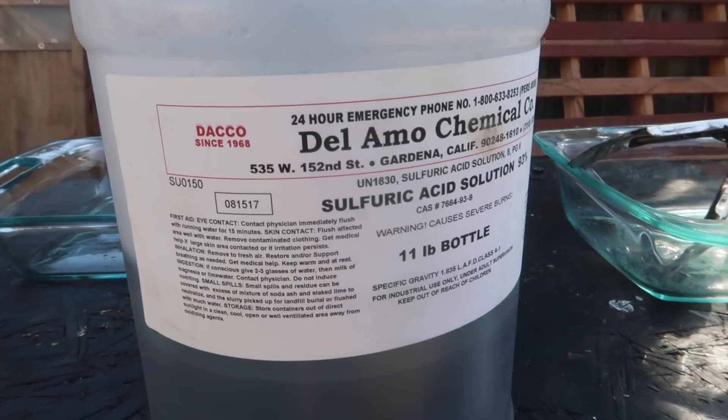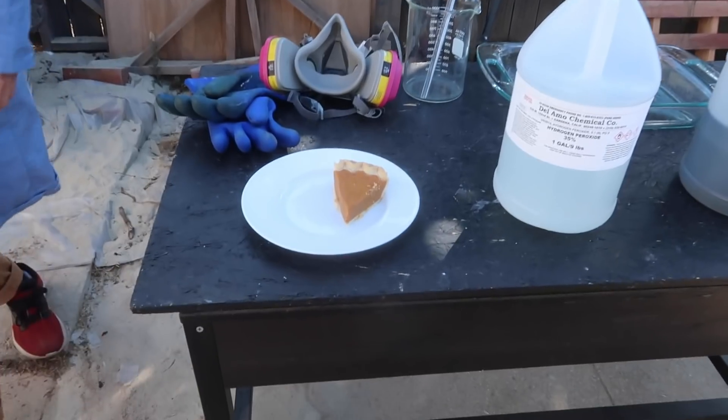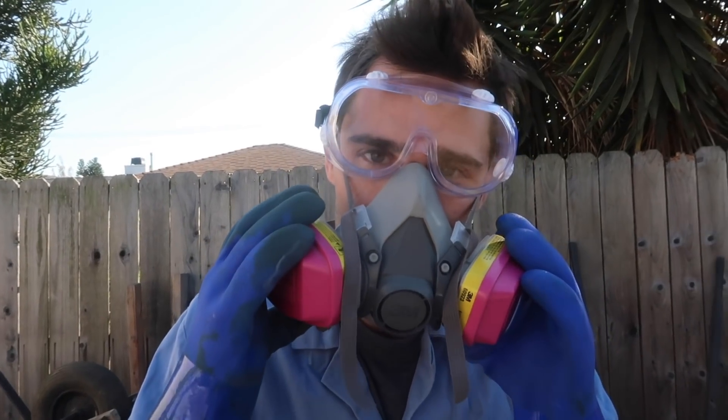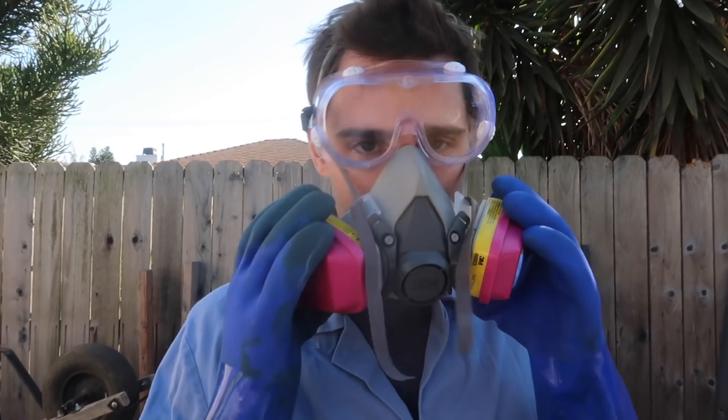You saw how aggressive sulfuric acid is just by itself. What we're going to do now is mix the sulfuric acid and the hydrogen peroxide together — it'll attack and dissolve. We're going to see if we can dissolve a piece of pumpkin pie in piranha solution. You have to add the hydrogen peroxide to the sulfuric acid, not the other way around.